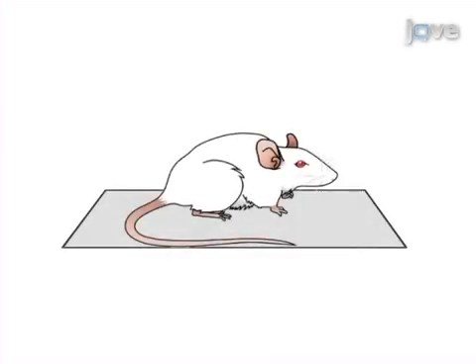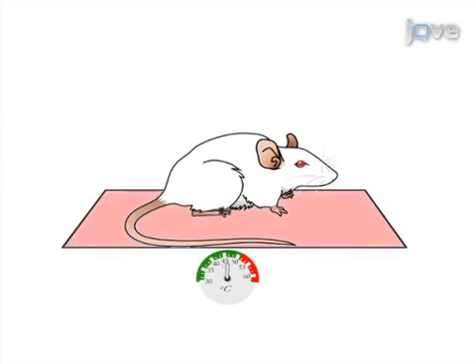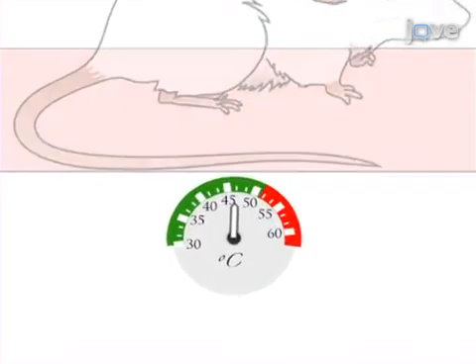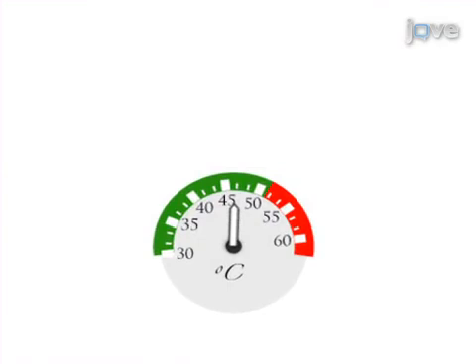The first step is to place an animal on the incremental hot plate analgesia meter. Next, the temperature of the hot plate is gradually increased. While the surface is heating, the animal is observed for nocifensive behaviours. When this behaviour is observed, the heating is stopped and the plate's temperature at that moment is recorded.